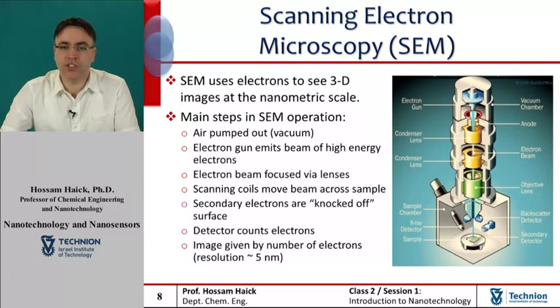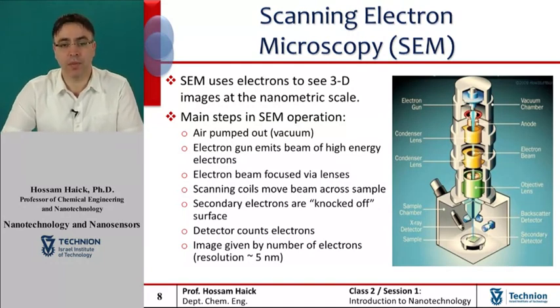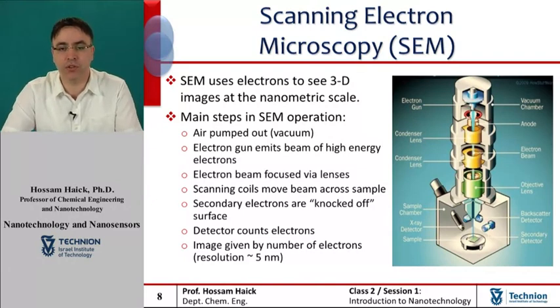The energy exchange between the electron beam and the sample results in the deflection and reflection of the high energy electrons by elastic scattering, emission of secondary electrons by inelastic scattering, and the emission of electromagnetic radiation, each of which can be detected by a specialized detector. The beam current absorbed by the specimen can also be detected and used to create images of the distribution of specimen current.